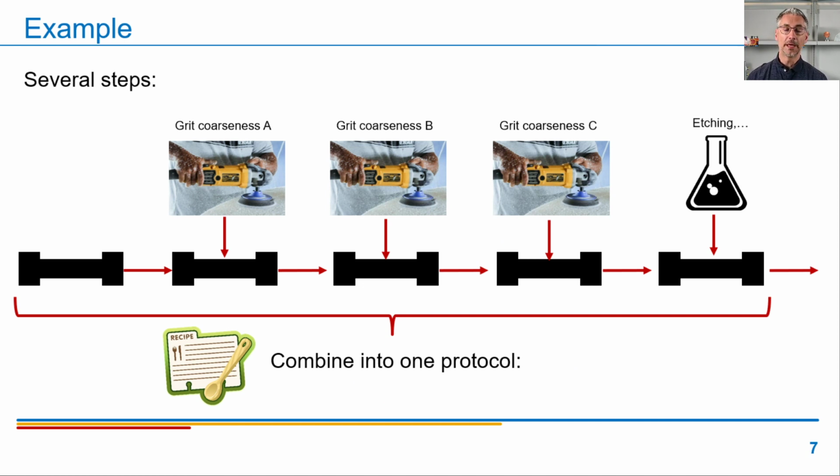Of course, depending on how many steps we have, either a combination of protocols or a longer protocol, we need to define, when we look at how we set up these protocols, what makes sense.